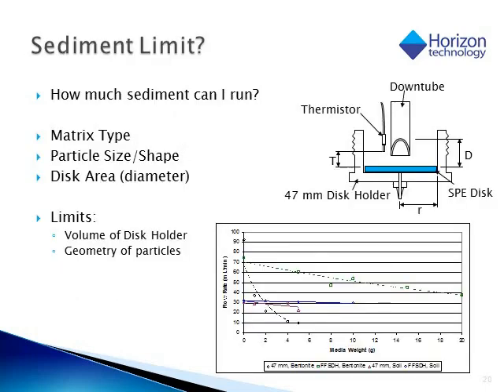But what happens when pre-filters aren't enough? How much sediment can I run using SPE? We get this question all the time. Usually, this comes from someone who has tried cartridge SPE in the past and remembers all the problems associated with that. Processing times depend on a lot of things, but mostly it depends on the geometry of the system. This means that the volume of the disc holder, as well as the shape and type of particulate being loaded into the holder, all matter.